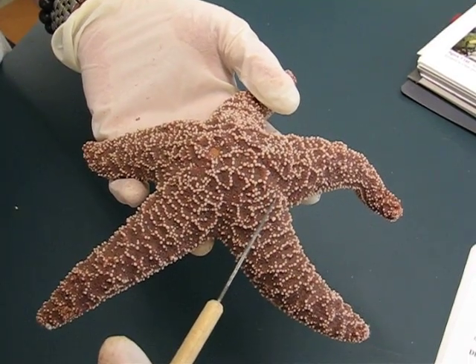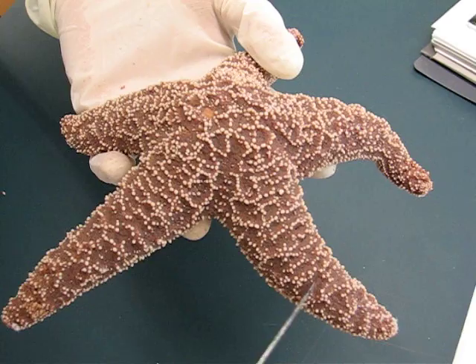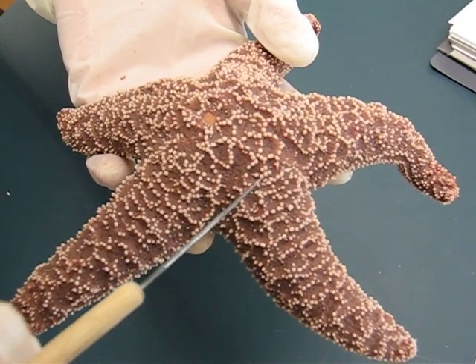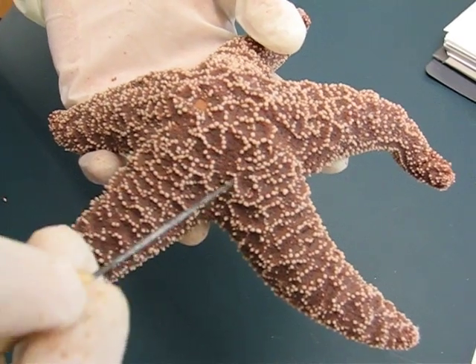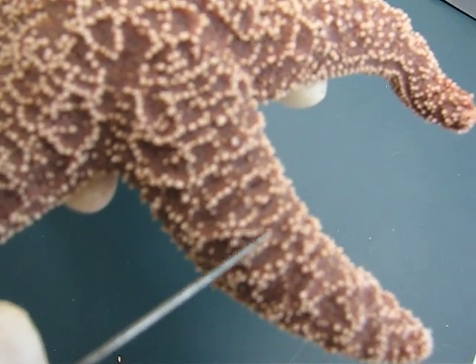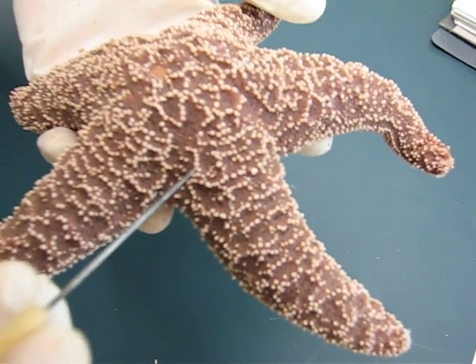We have the spines — the spines are the little white dots you can see here. You have the dermal brachii, which are actually deflated bubbles. It's kind of hard to see with the camera, but if you fill it up with water, you can see them more easily.